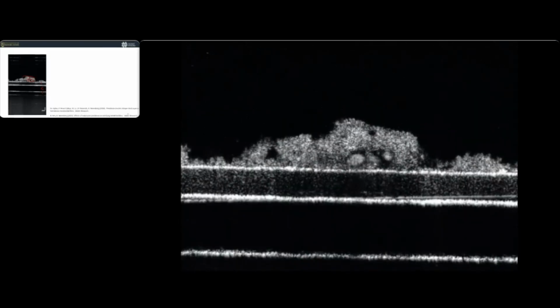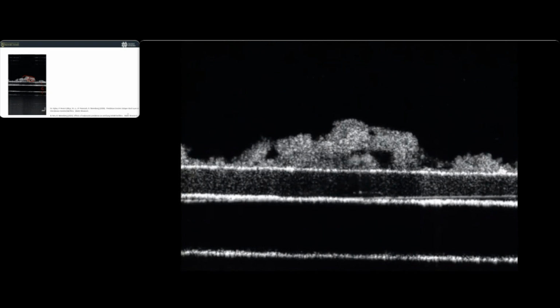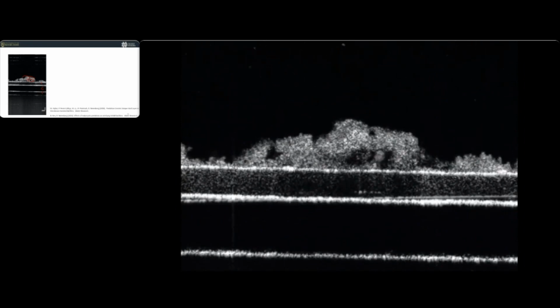This is a real-time movie. This is, I guess, what's actually happening. A second in the movie is a second in real time. So you can see things moving around. This is kind of a long video, so I'm not going to go through the whole thing, but hopefully you can see at the bottom of the biofilm, in that hole, things are moving around and moving in and out of the focal plane.